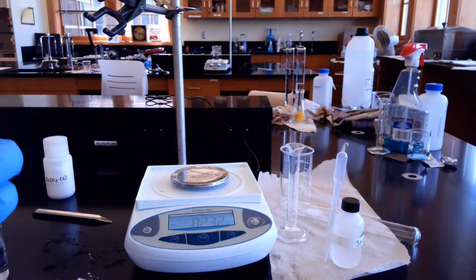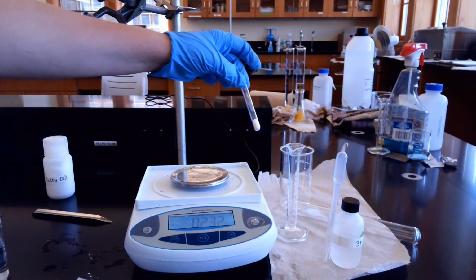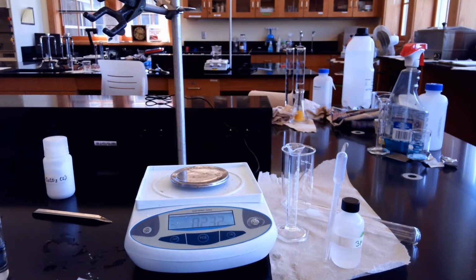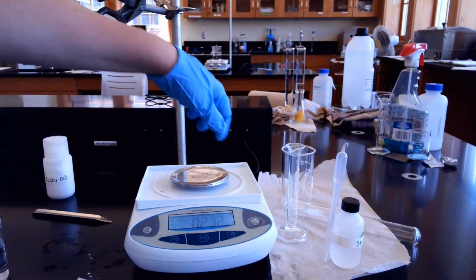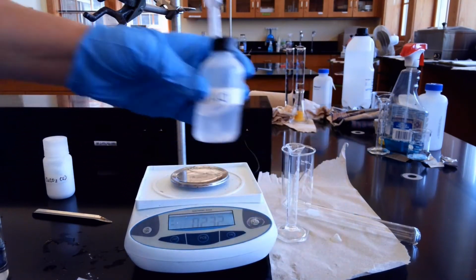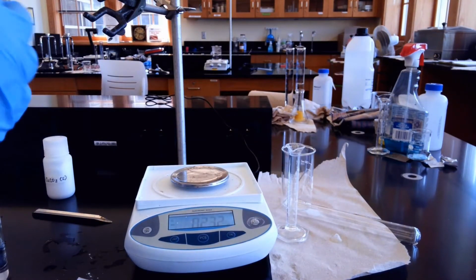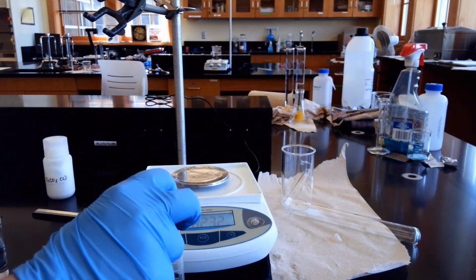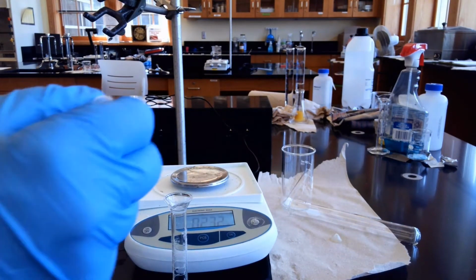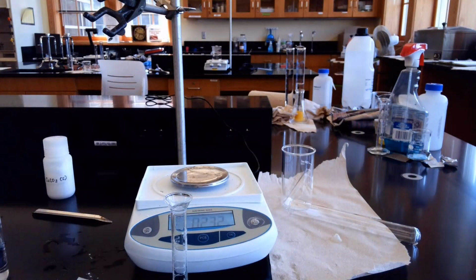Here we go. So this we're just going to set aside right now to sit. Put it right over in here. The next step we have to do is fill up our larger 200 millimeter test tube with 10 mils of 3 molar HCl. So we're going to take our HCl over here. We have our graduated cylinder. And we're going to fill in our 10 mils.